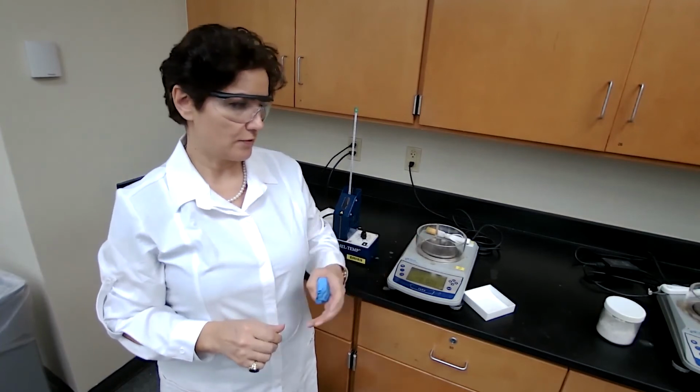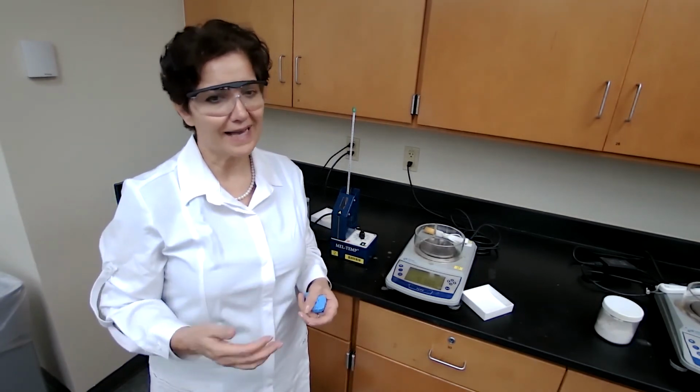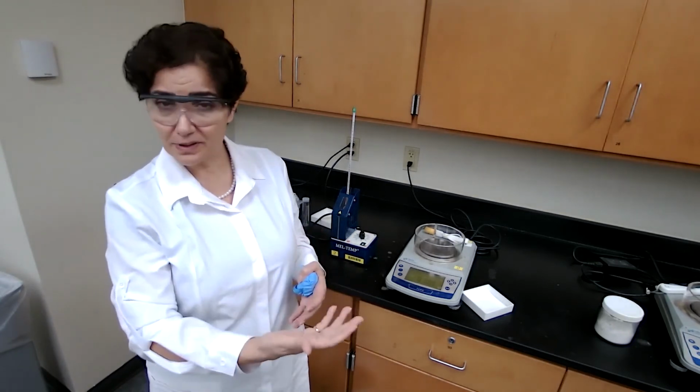The data you have collected from this experiment is the mass recovered for the neutral compound, the mass recovered for the organic acid, the melting point for the organic acid, and the melting point for the neutral compound. Now, the mass recovered, or percent recovery of each mass, can tell you how efficient your work was and how much of the sample you have lost during the process, or if the extraction method was efficient enough to give proper percent recovery for each of the samples separately.